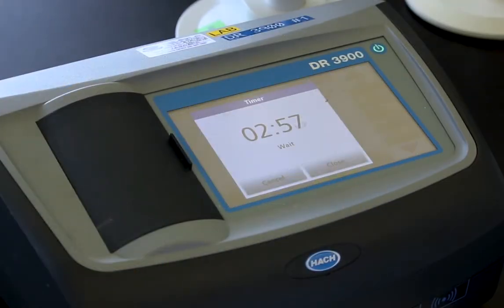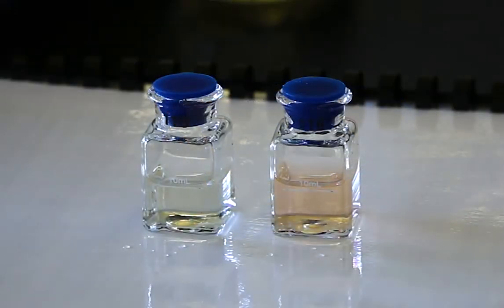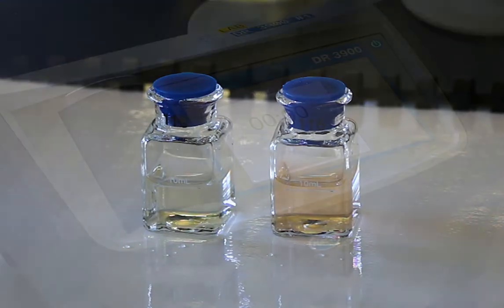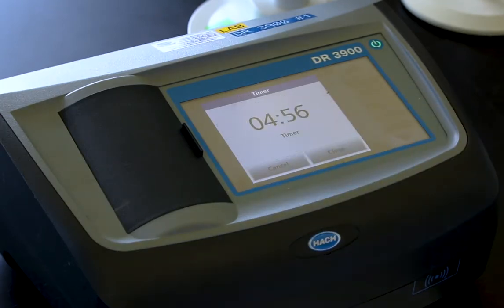Start a timer for 3 minutes of reaction time. An orange colour will develop if iron is present in the sample water. If the sample contains visible rust, add 5 minutes to the total reaction time.